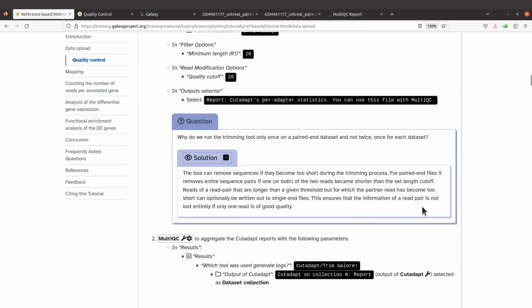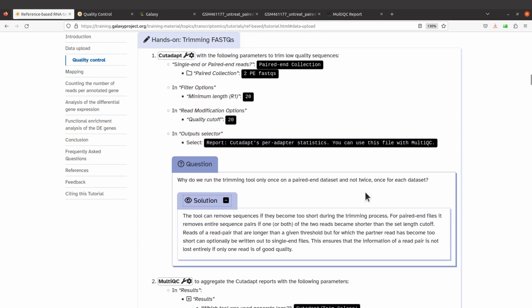And so if we supply those files to the trimming tool, whatever processing that is done for read 1, that's the forward, the same processing should be done for the reverse, that is read 2 in our case. Now linking that to, let's say, filtering. Let's just say we want to remove some reads.